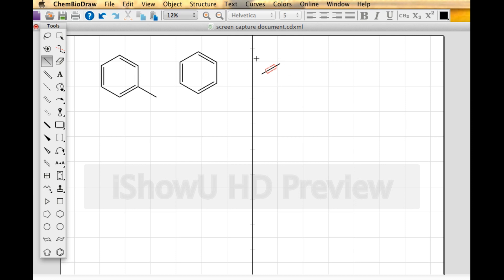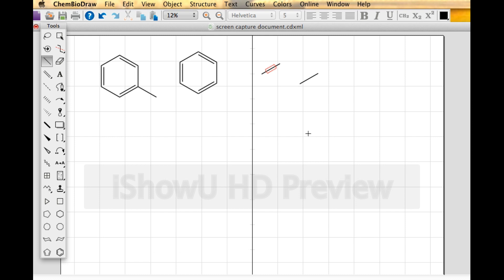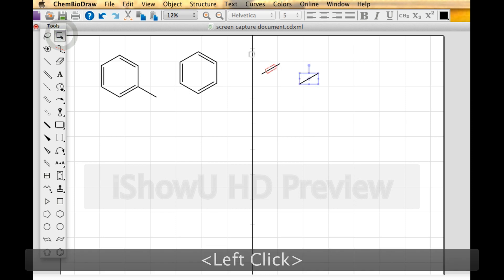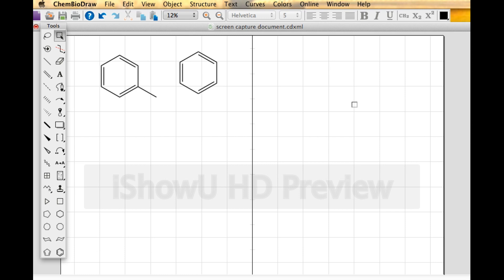This is the molecule ethane, but ChemDraw figures that if you're drawing something it'll be more complicated than that. So whenever you draw ethane, it'll put a little warning on there simply because you have a stray bond hanging around. I'm going to go back to my marquee tool, select both of these things, and then delete them.